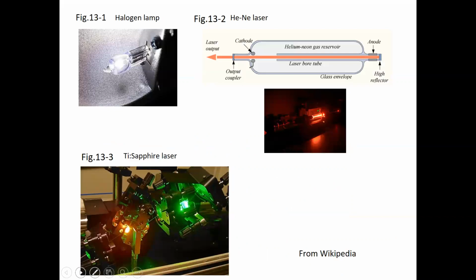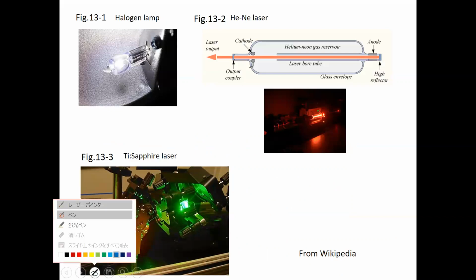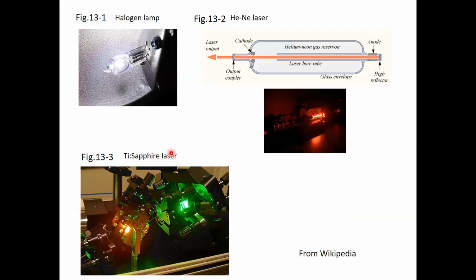So as you see, this is the titanium sapphire laser. Here is the titanium sapphire, which is resonated. Here's a resonator, and the laser is coming out.